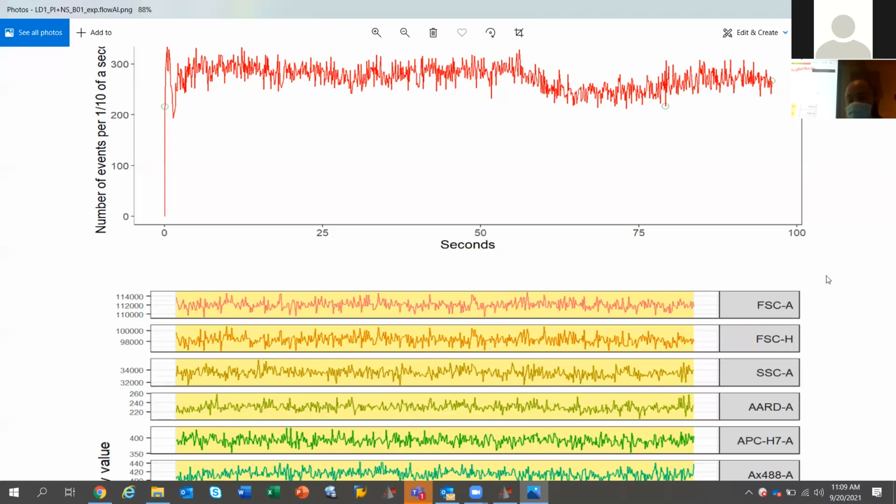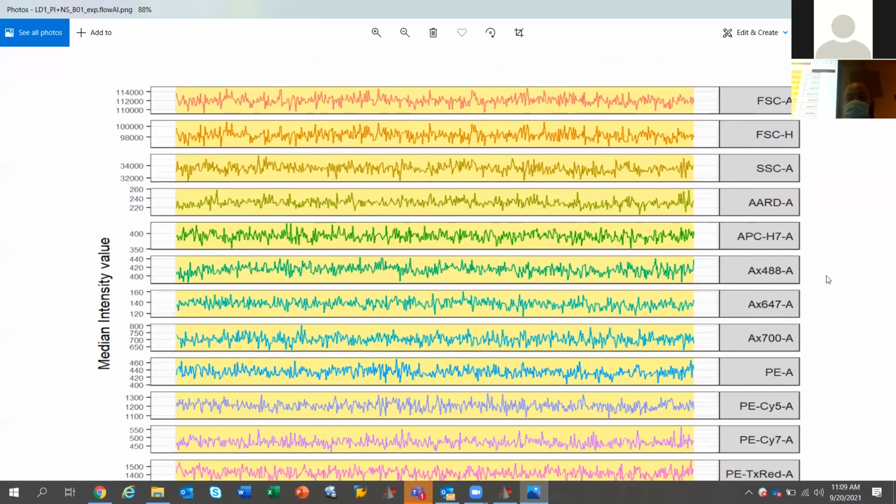All right, so the next part is down here, which is your signal acquisition, which is the one we were looking at under the metadata. So this is another figure for that. So it's doing all these analyses on your behalf very quickly. That way you know what's good and what's bad.